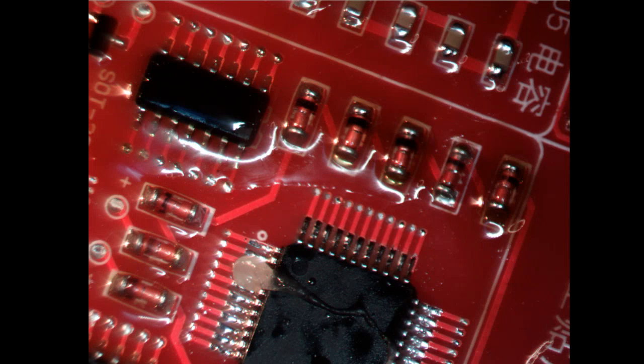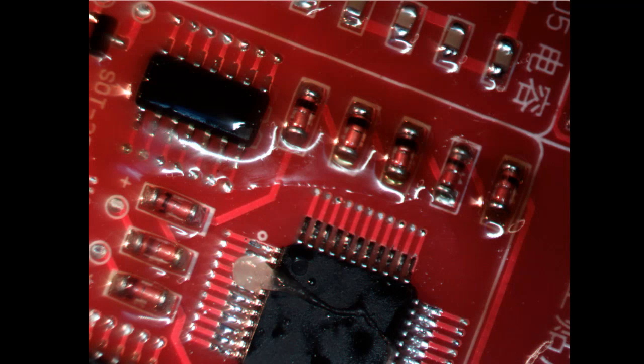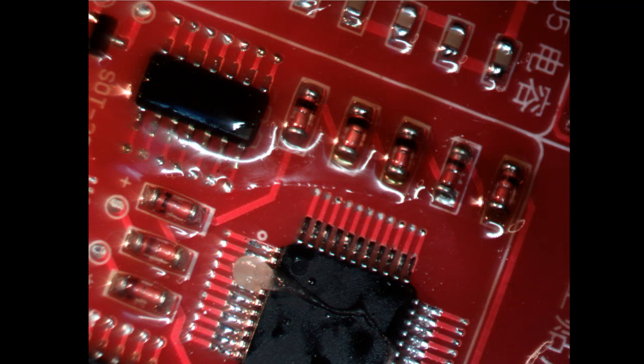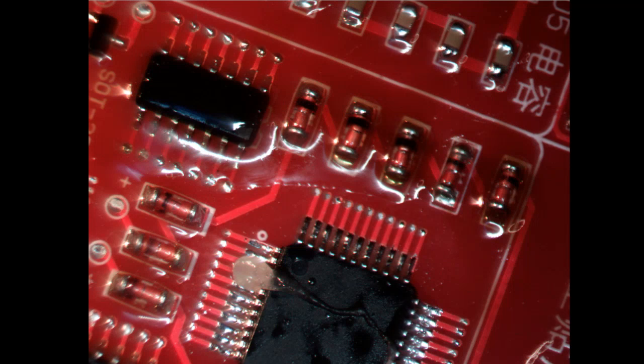So there we have it. This is the Amscope MU503 camera. I'm not very happy with it. It does its job, basically. It's probably fine for still images. But for video, no.